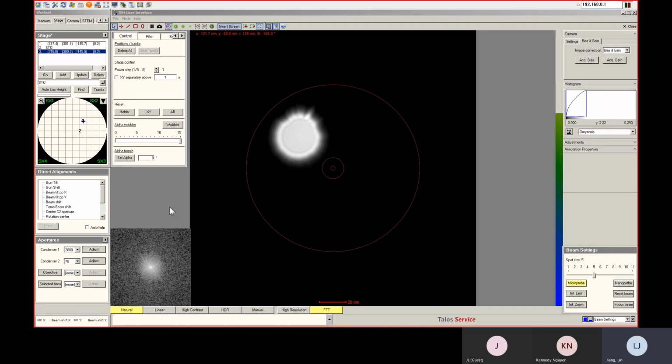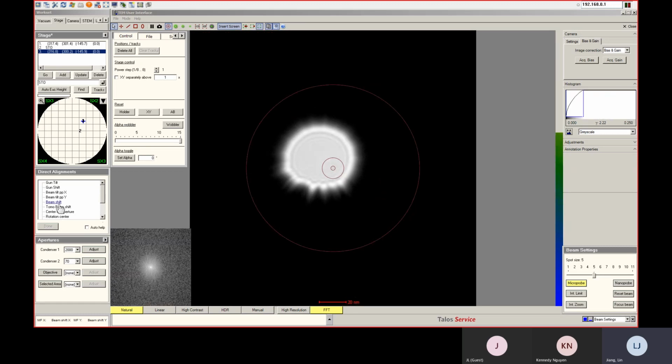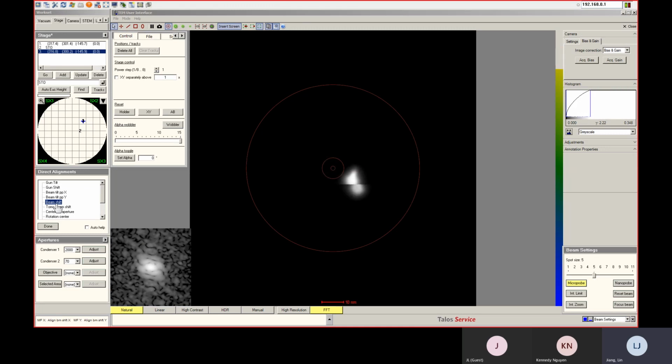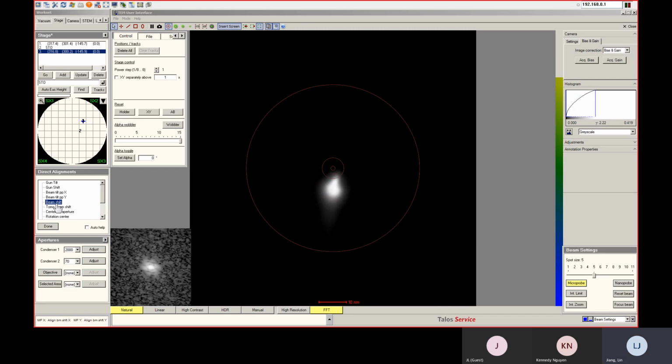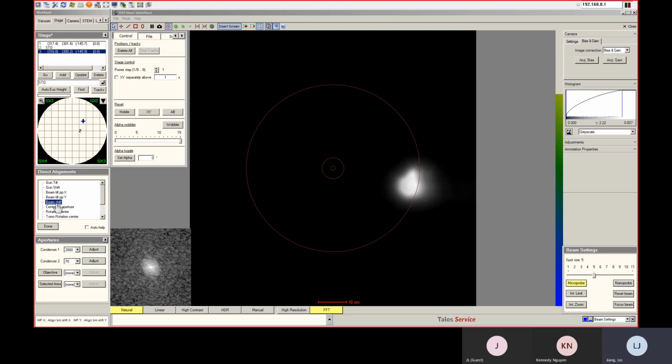Usually we go to the magnification. For the high mag, we are going to the magnification MH mode. So now we are in SA mode. If we keep zooming, we're going to reach the MH mode. So this is the highest SA, it's 630. Okay, if we keep going, we reach the 650.